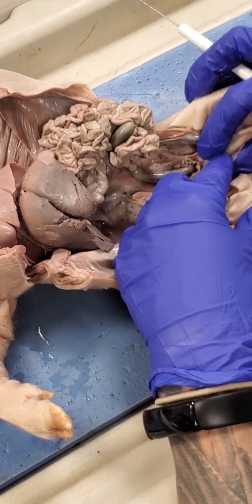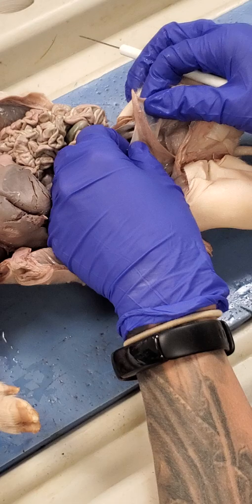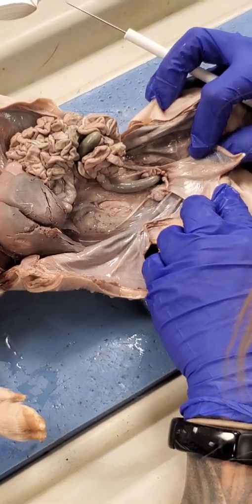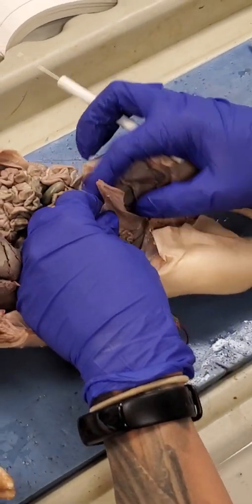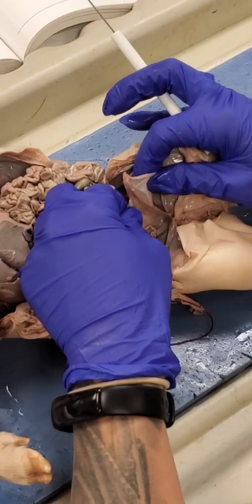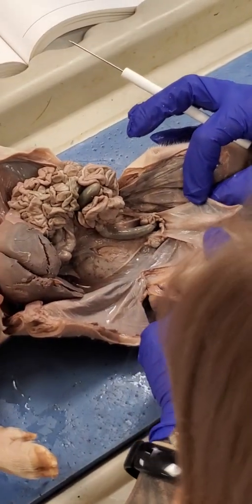Urinary bladder. I think that if I cut this connective tissue, it might separate that some. So we're just gonna call this our urinary bladder, but likely I'm not really gonna ask about it. But just in case, Steven or somebody wants us to put it, I'm gonna pin this thing. The middle thing or the whole thing? This thing.